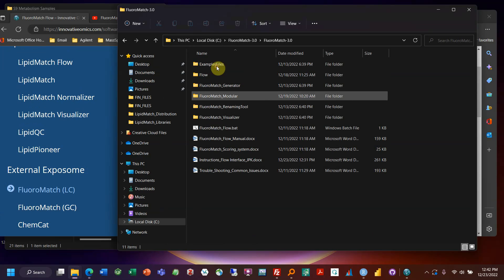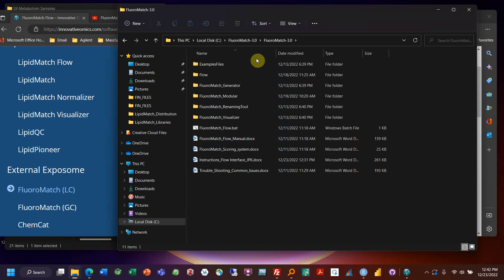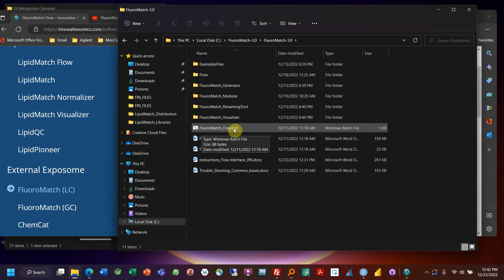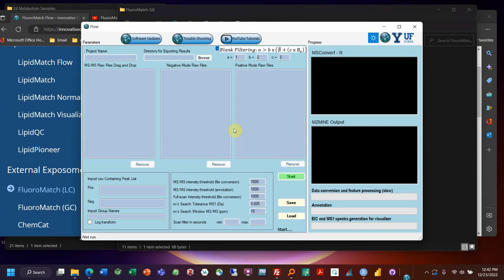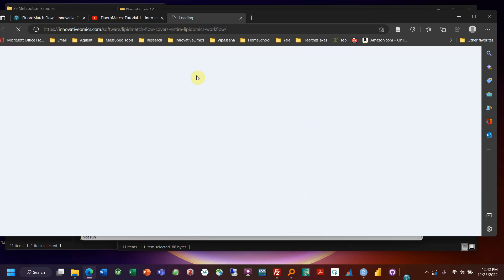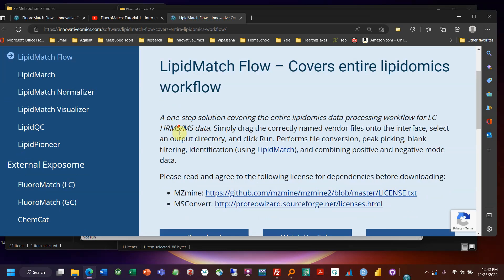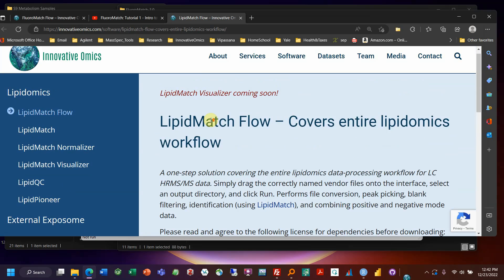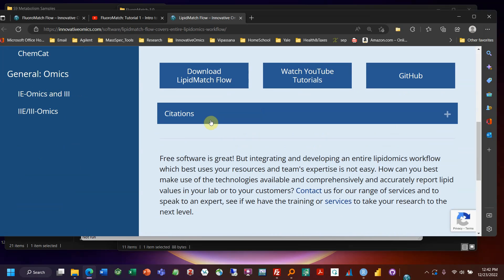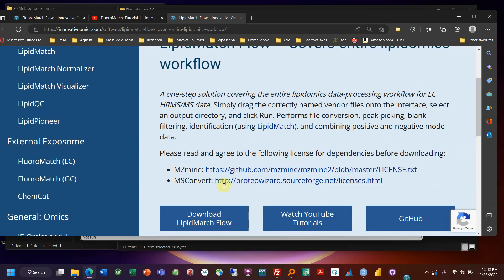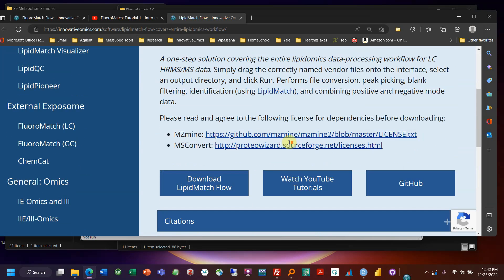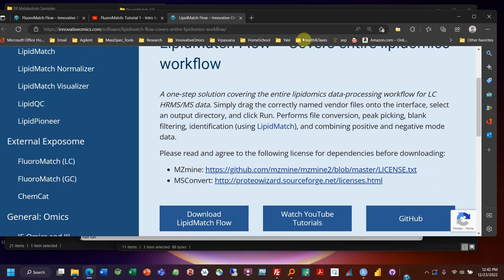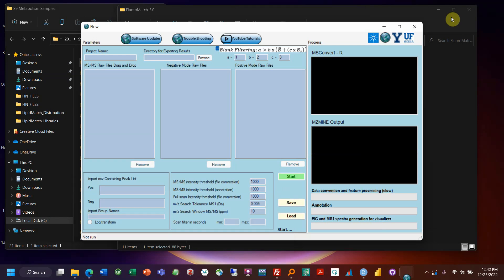Once you extract it, this should look something like this. You'll get this .bat file, FloroMatch underscore flow dot bat, and that's going to be your software. And so here you can see you can go back if you want to look at any updates. You can go back to the website and make sure that you're using the latest version which will be updated here. You can also ask for help, watch the YouTube tutorials, and then also see the supporting institutions and their websites here.